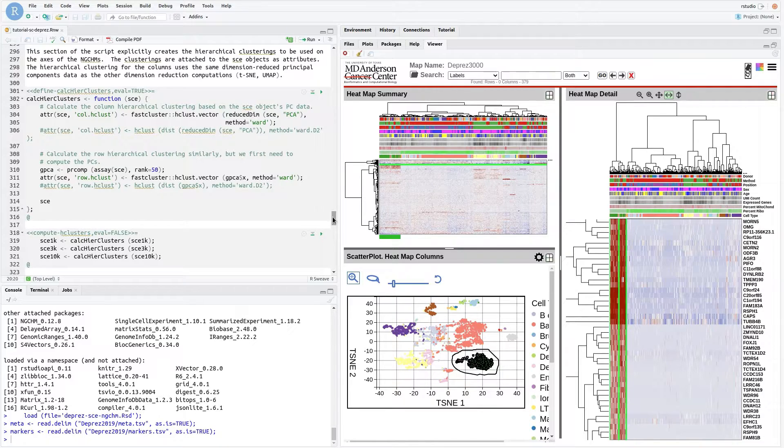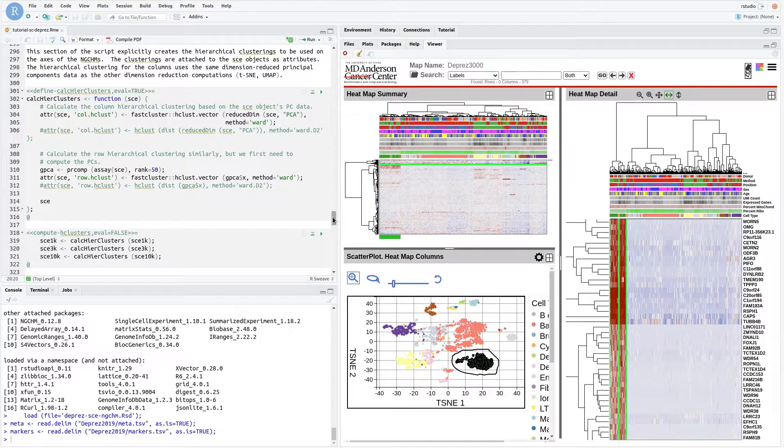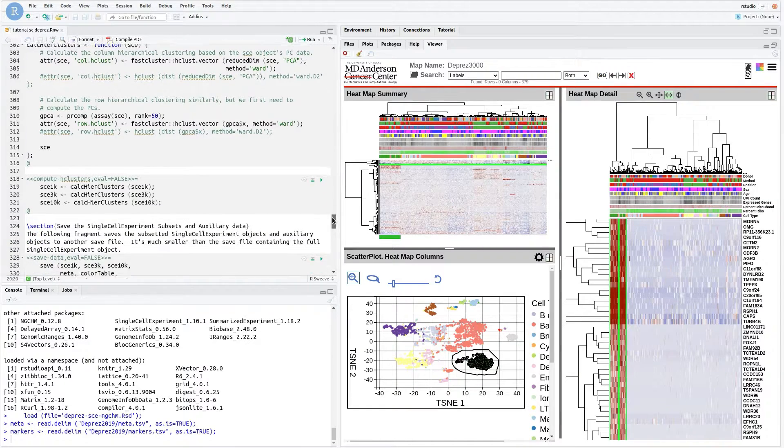The rows are clustered using the same approach. However, the principal components for the row axis need to be computed here since they weren't earlier.